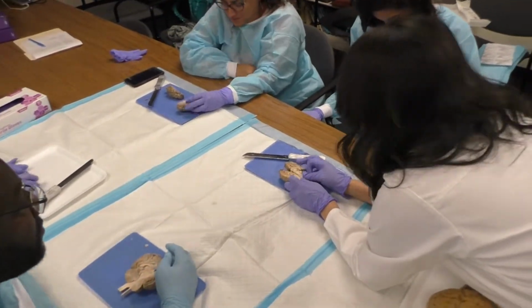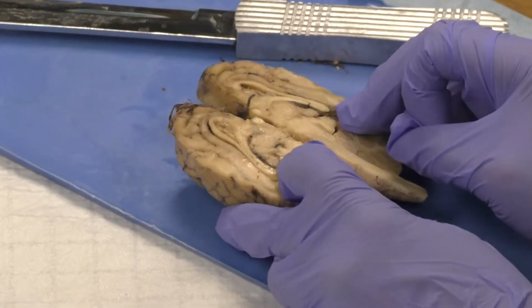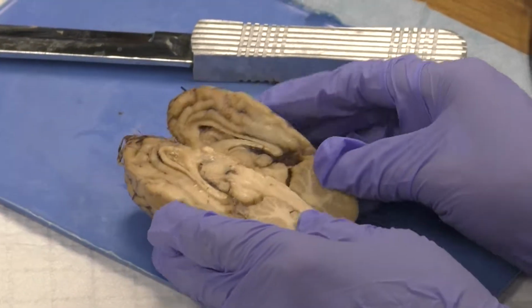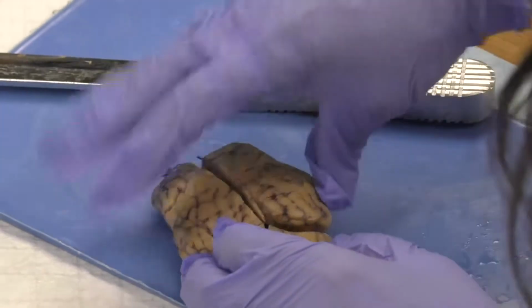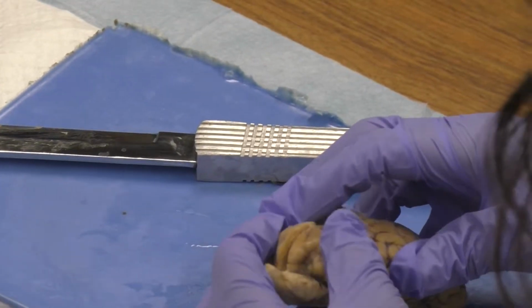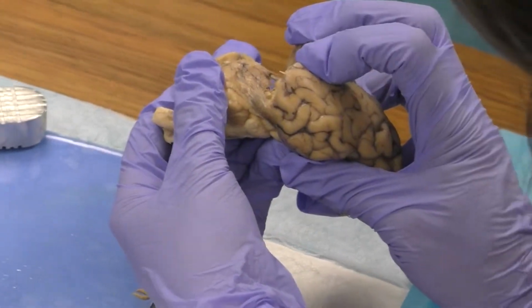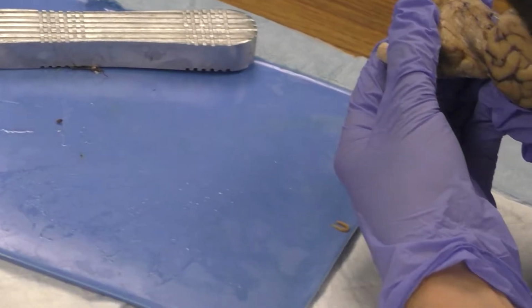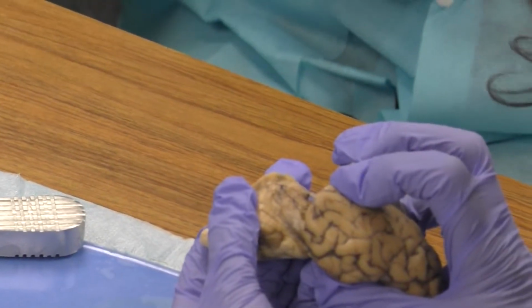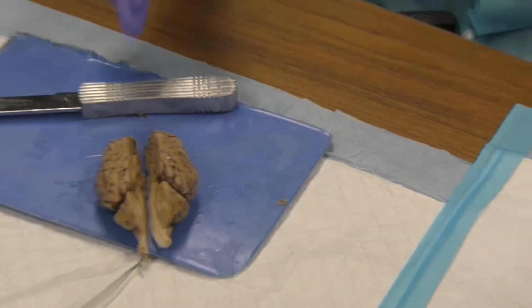So we have the thalamic bump, kind of towards the front. We have the bump of the pineal gland, and then here's yet another bump. The best way to look at that is to put it back together and do this. Can you see those? There's like four bumps. If you look at it in the back, the bump on the top is big and the bump on the bottom is little. So that is the midbrain, the superior and inferior colliculi.